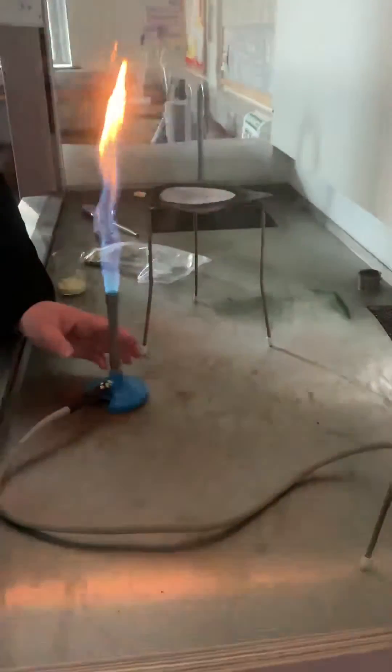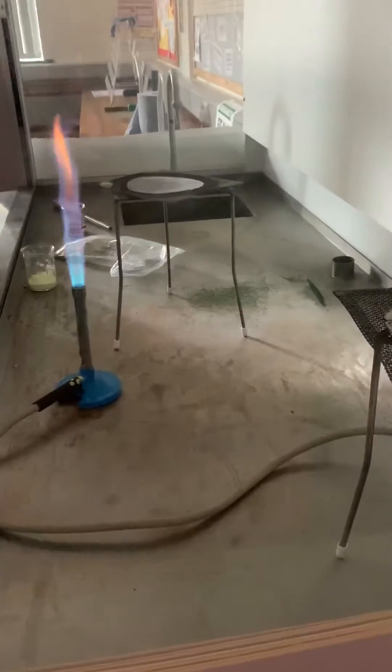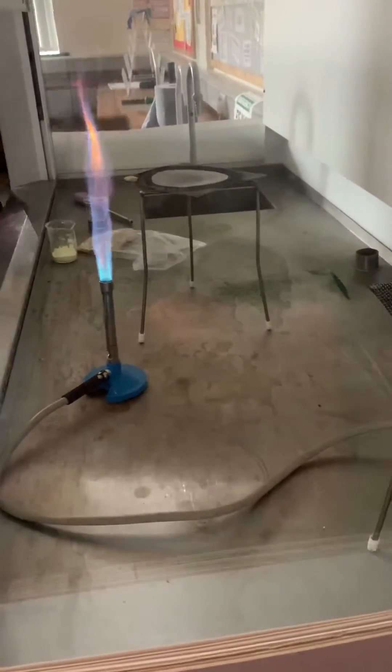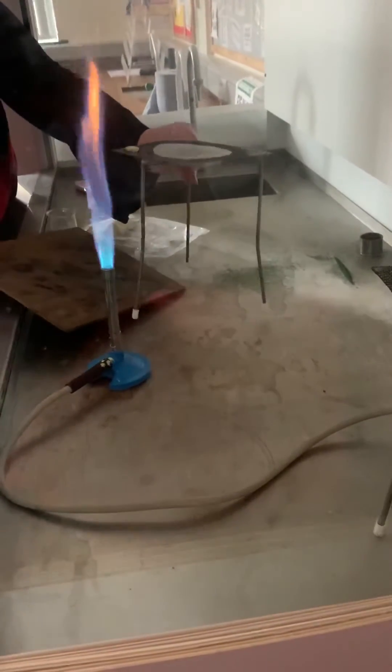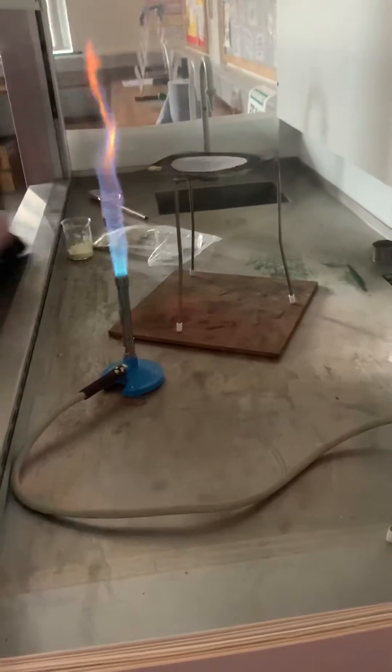All I'm going to do is use the Bunsen burner to light the sulphur, then move the Bunsen burner out of the way and turn it off. What you should see is a blue flame. The sulphur might start to melt, fall through the gauze, and drip onto the safety mat, so you might see some blue flame on the safety mat.